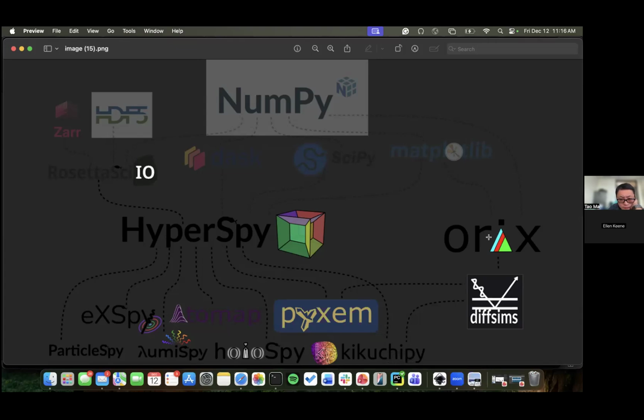Orix, if you've used MTEX before, is the Python equivalent of that. So looking at rotations and crystal orientations. And then DiffSims, this is a very simple kinematic diffraction simulation package. If you're trying to do more complex simulations, then I'd recommend something like abTEM. But this is a quick and dirty way to get some kinematic diffraction information.